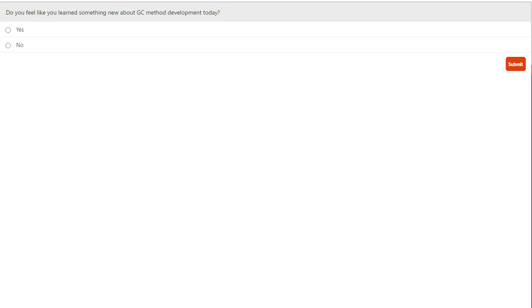In terms of the other characteristics of the column, the film thickness will also give us a good indication of retention. A thicker film thickness will be a good suggestion there. So instead of perhaps using a 0.1, we might want to use a 2.5 or even a 10 to get a decent retention time on that one. So that would be my initial suggestions.